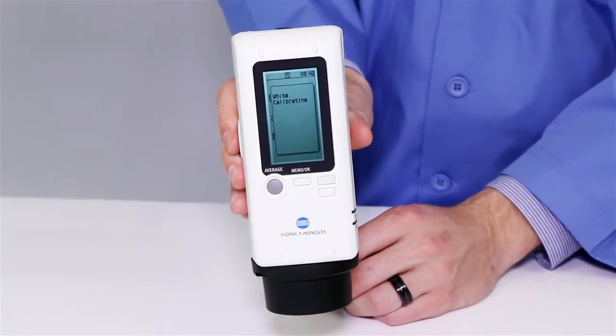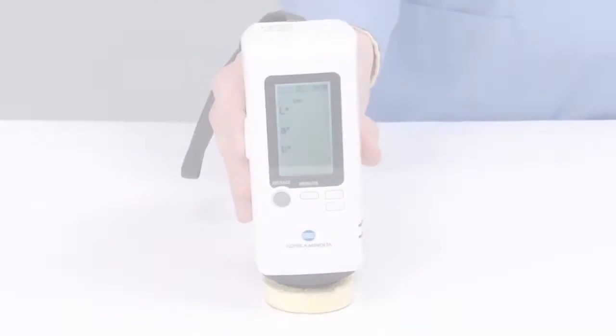The CR20 color reader gives you the freedom to analyze total color with confidence.